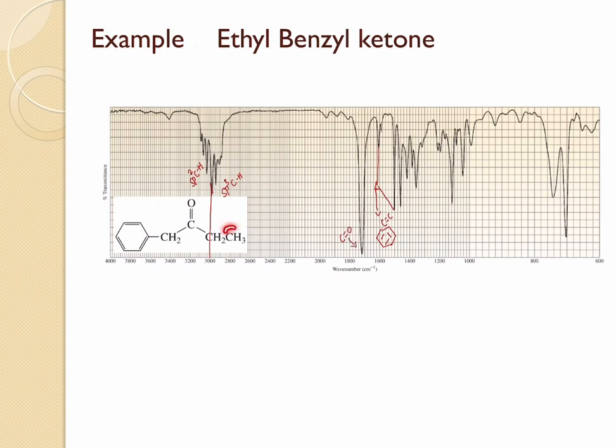And then we also have a methyl group, for which we are going to look around this 1400. On the right side, we do see a peak around 1380 centimeter inverse, and this is going to correspond to the CH bend present in the methyl group. So with all of this, we can definitely justify that this is the IR spectrum of this compound.